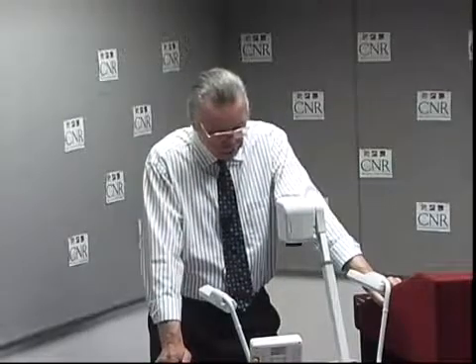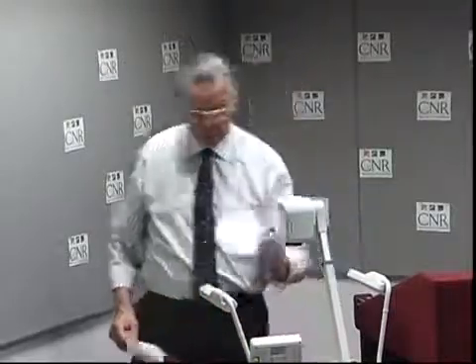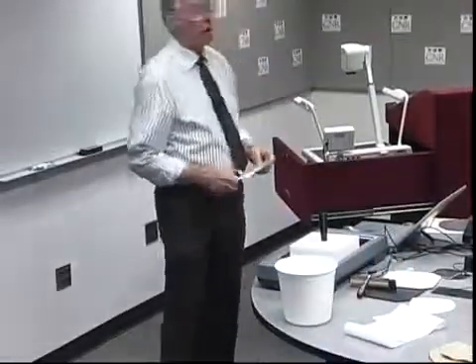The test is a bit more comprehensive and simpler in the methodology. We'll take this same hand sheet that is wrinkled, and I want to show you how we would do it in a process operation. Now here in the studio we are limited.